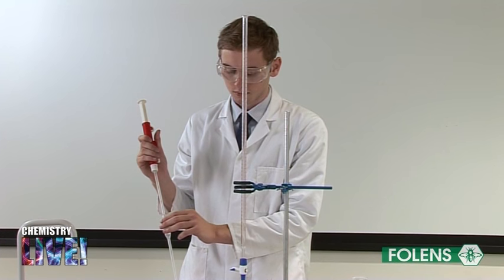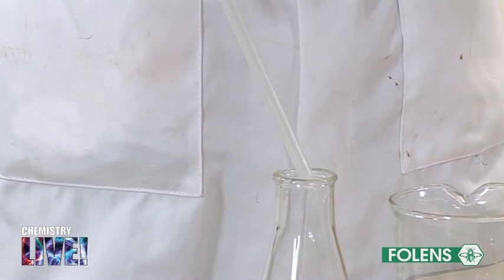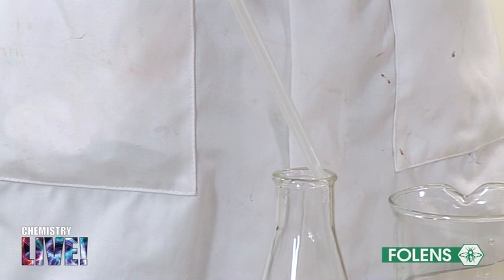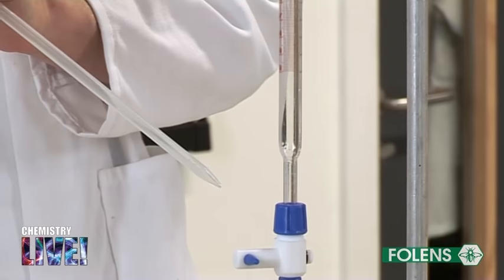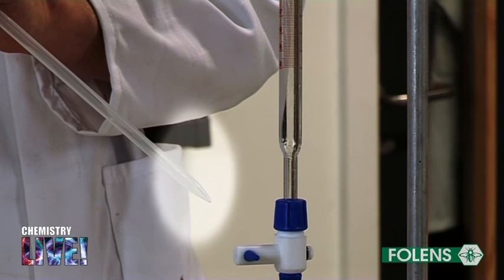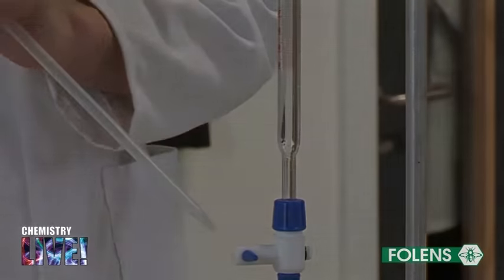When the discharge is complete, touch the tip of the pipette against the side of the flask and wait a few seconds before removing the pipette from the flask. This is called draining time. Having removed the pipette from the flask, it will be observed that a small amount of liquid remains in the tip. Do not blow out this liquid into the conical flask. It has been taken into account when the pipette was calibrated at the manufacturing stage.